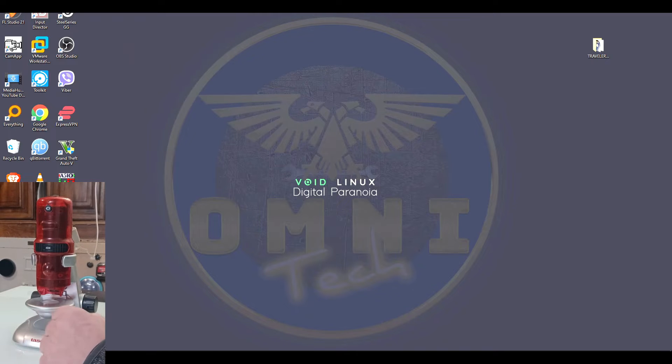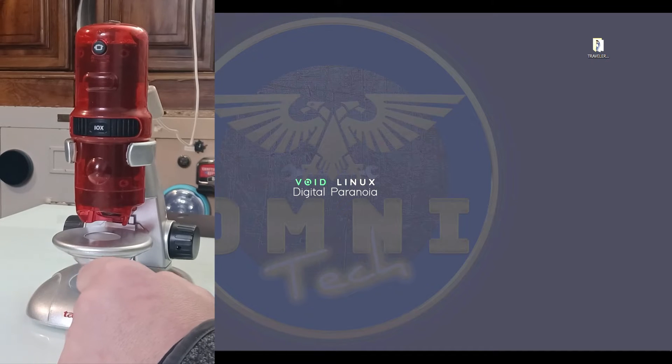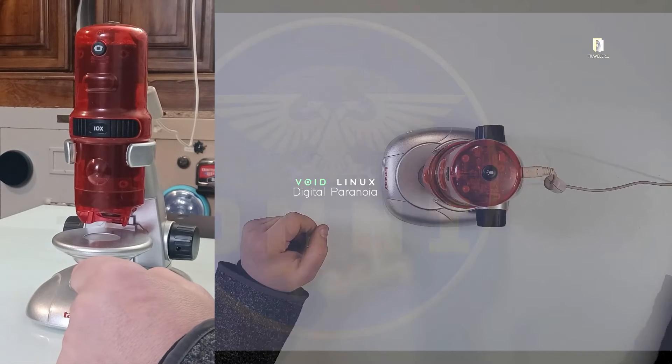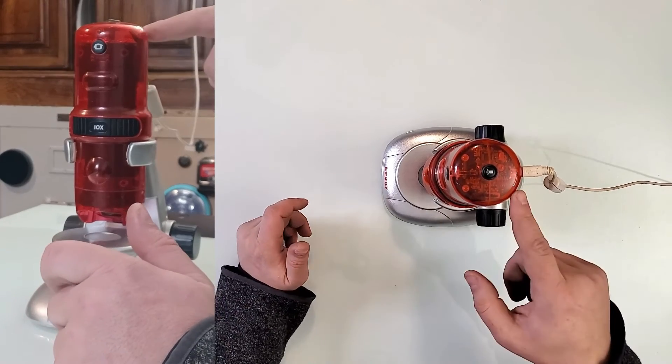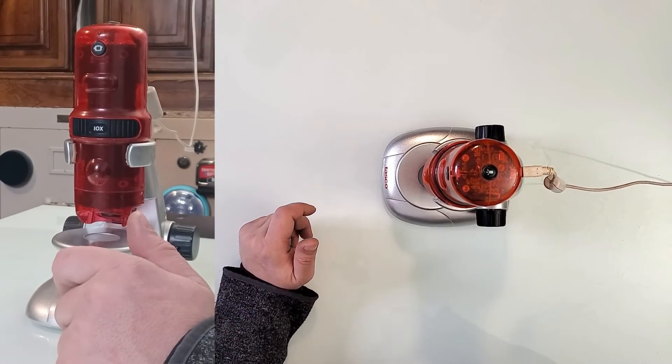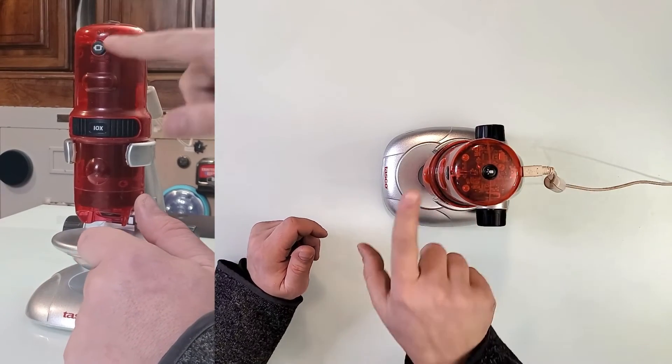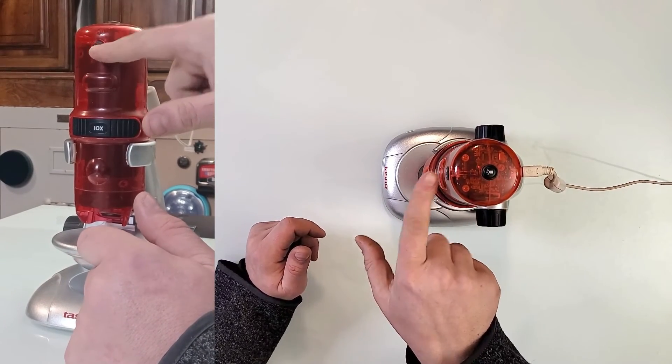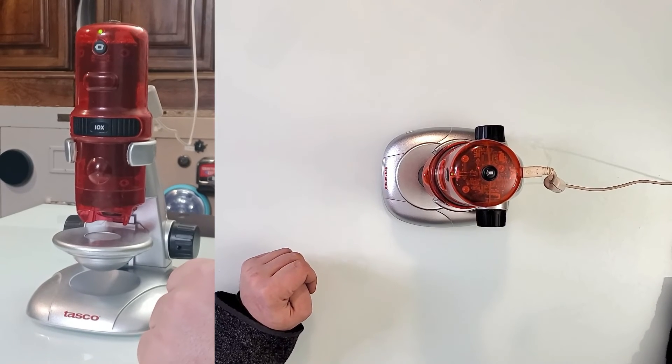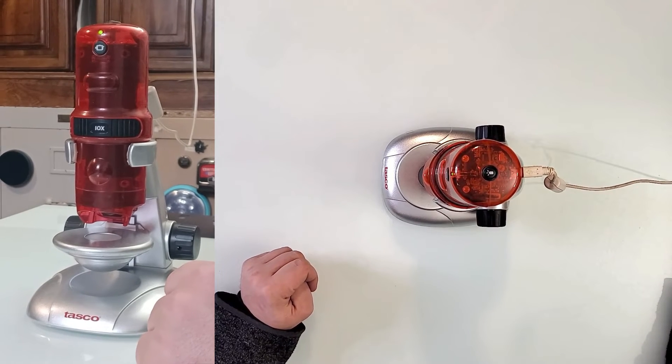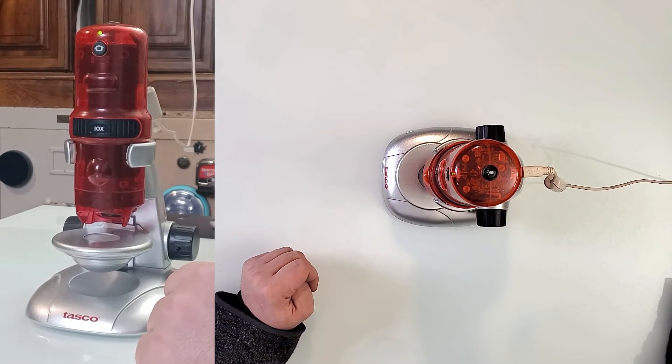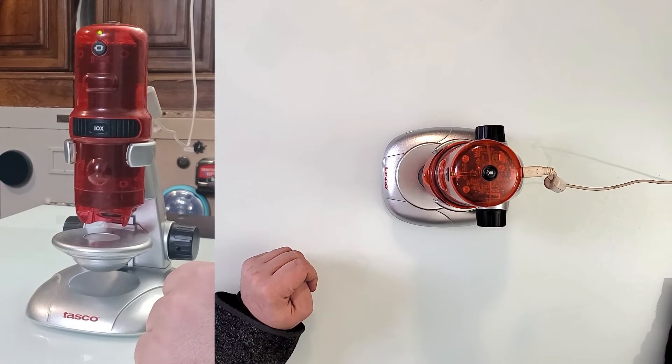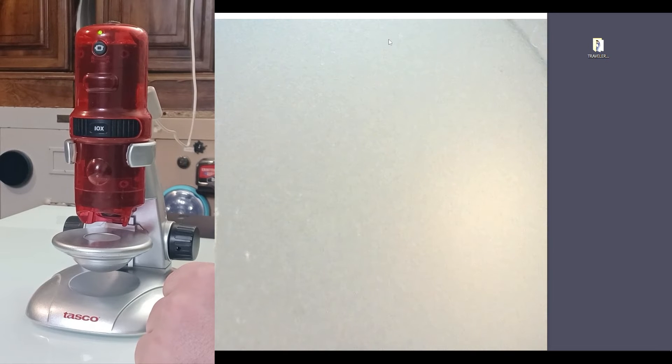Let me flip you to the actual microscope. It is connected right now. Let me just click this camera right here, it will connect directly. And as you see, let me put the screen now right here. This is what you will see from this camera.